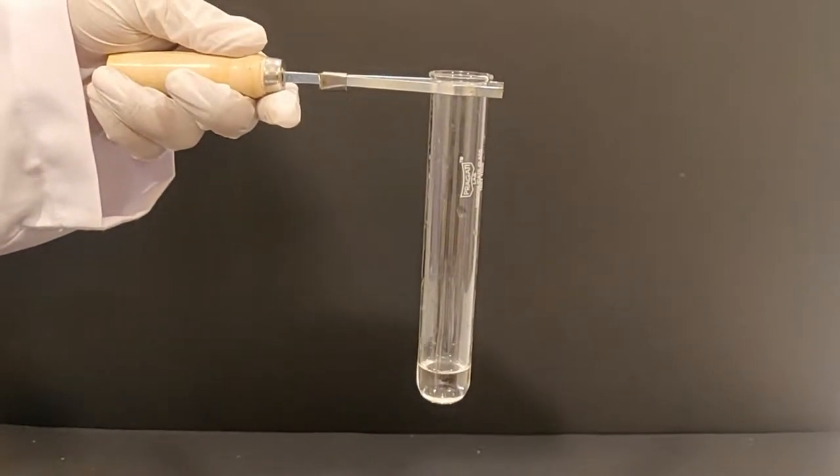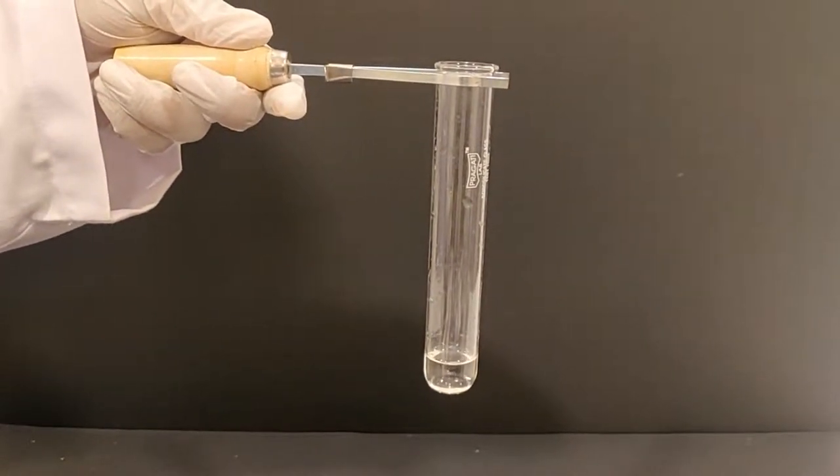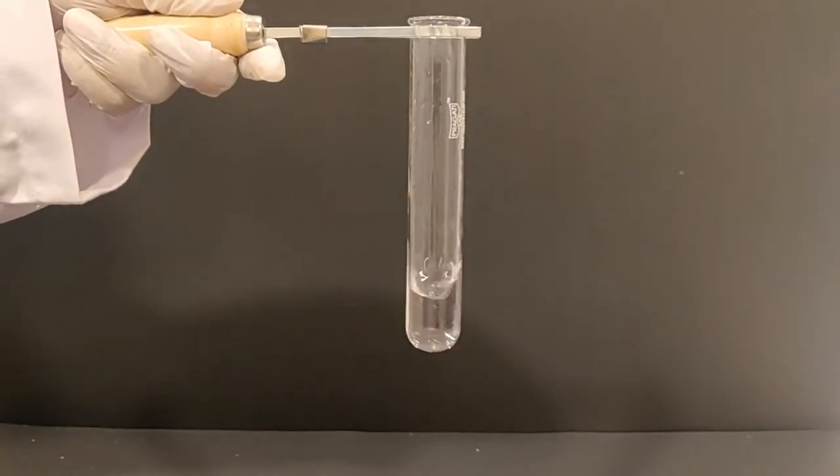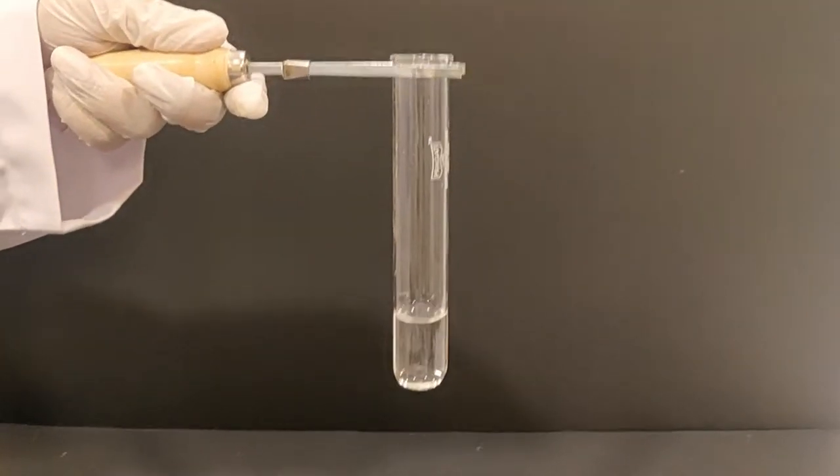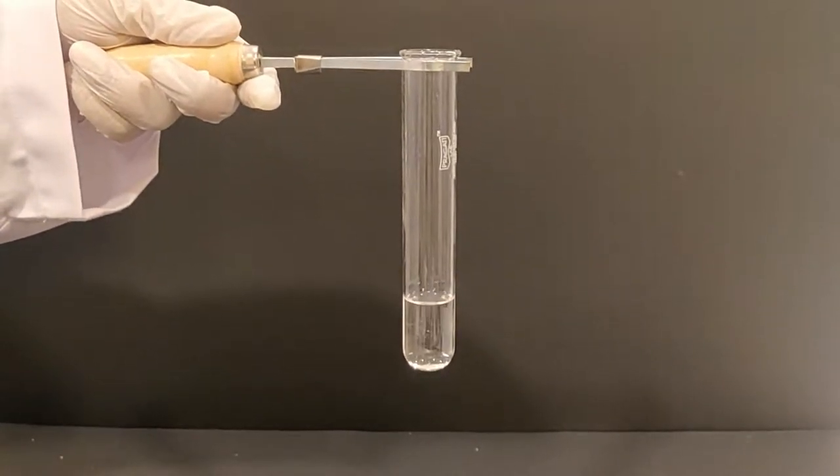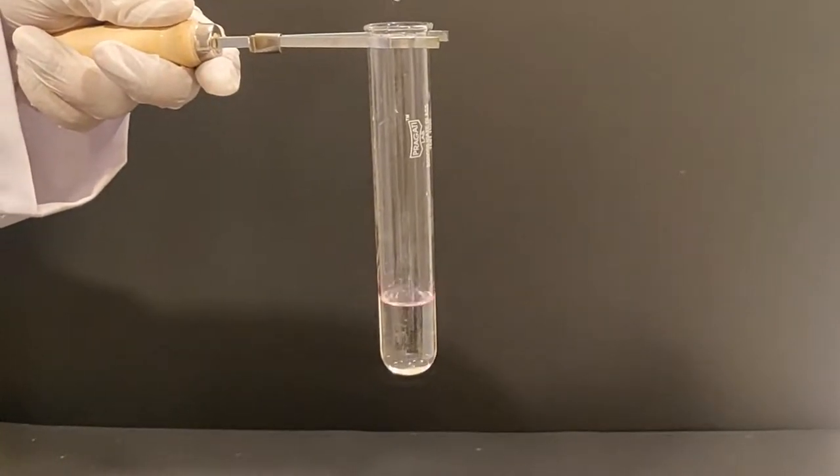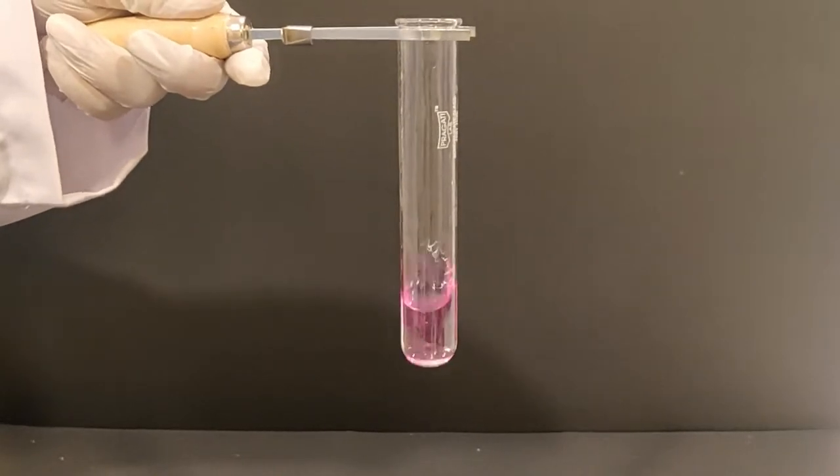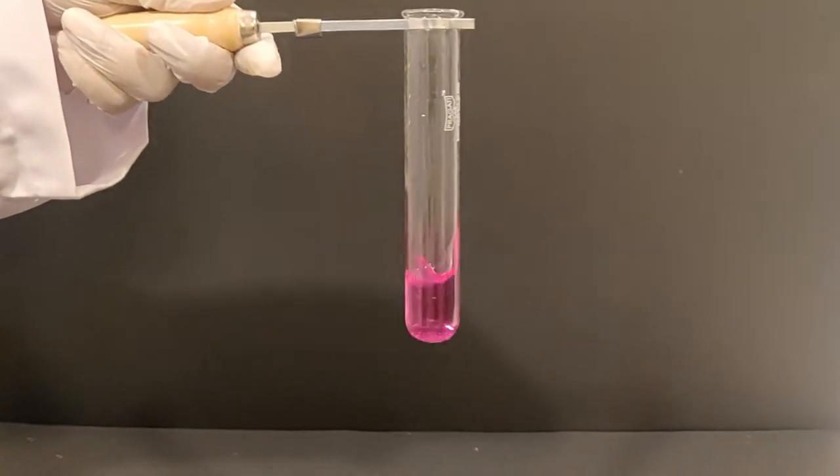Keep checking for any color change in the contents of the test tube. After a few additions, the color of the liquid in the test tube will turn pink. This is the phenolphthalein indicator at work.